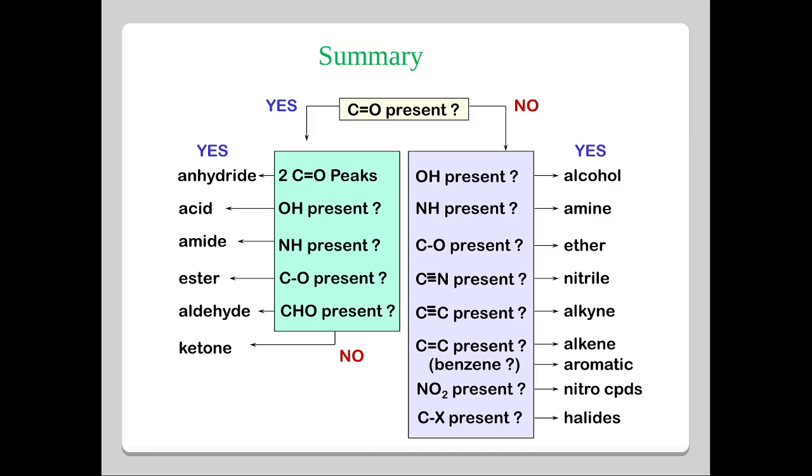If you need to find out the molecular structure from a given IR spectrum, you should start to look for peaks. But you can develop a protocol, a methodology, or a typical format to look out for how to find the peaks and how to assign the peaks to a typical bond or a typical functional group.